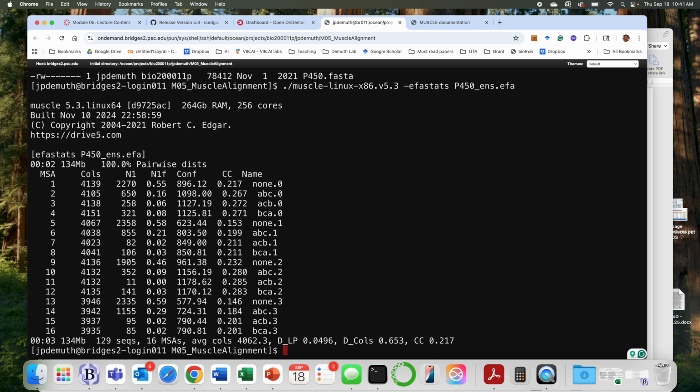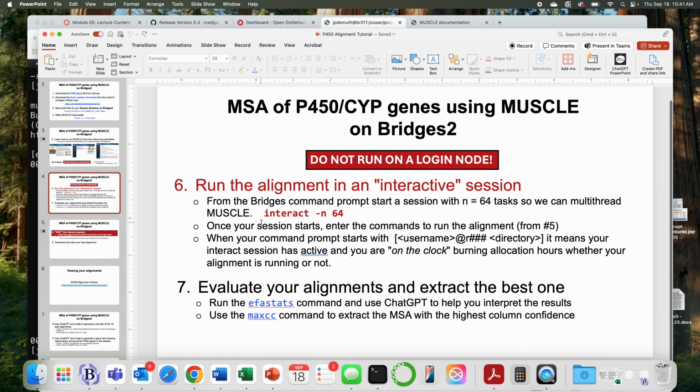I'm going to keep going just so that it's in the recording for the lecture. And if you're hung up because of the interact session, you can go back through this and hopefully walk through it on your own. So on the PowerPoint, I'm on step 7.